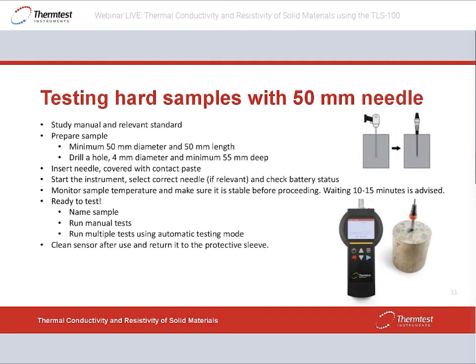Once you have your nice hole prepared, you cover the needle with contact paste and make sure that the entire needle goes into the sample. That's very important. You can't have part of the needle exposed. It should look like the picture down here, where the handle of the needle is in perfect contact with the sample, to make sure that there are no issues with heat losses from the needle itself to surroundings.